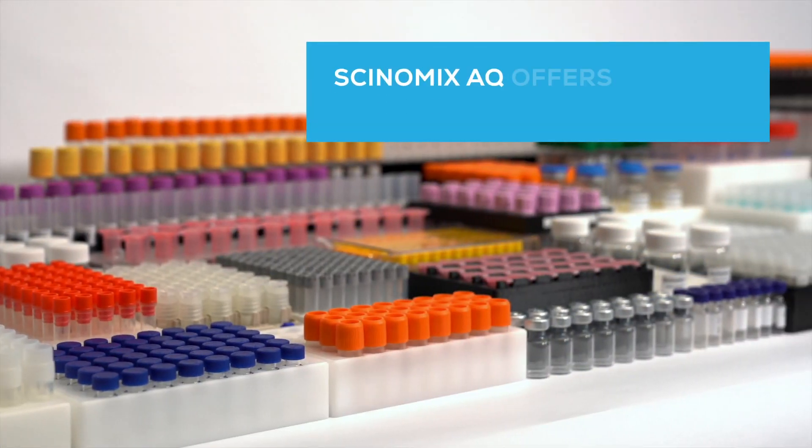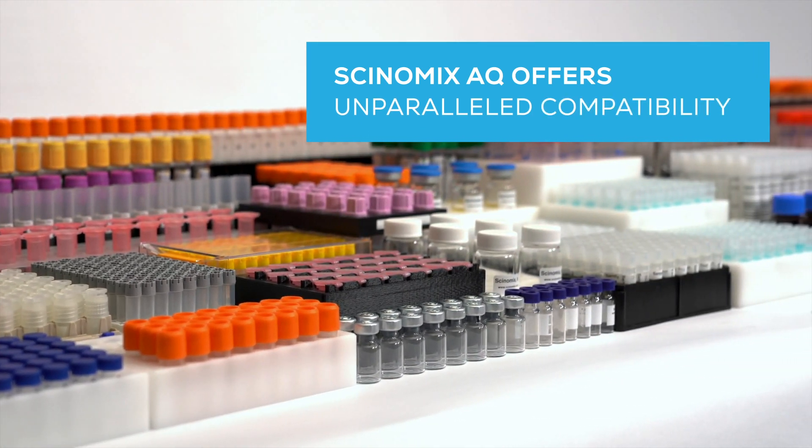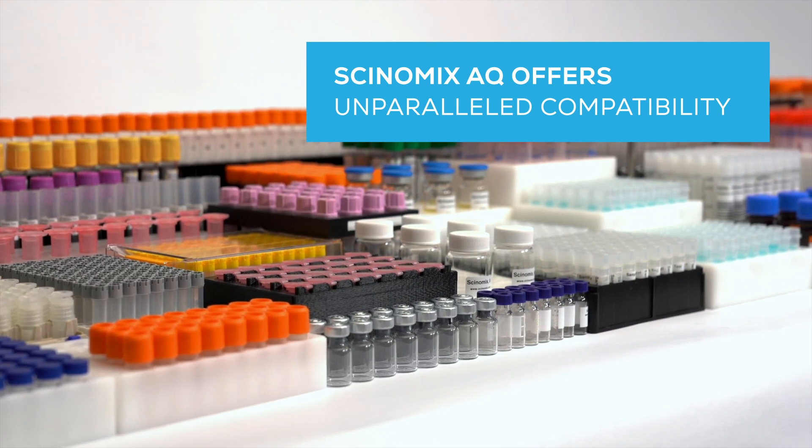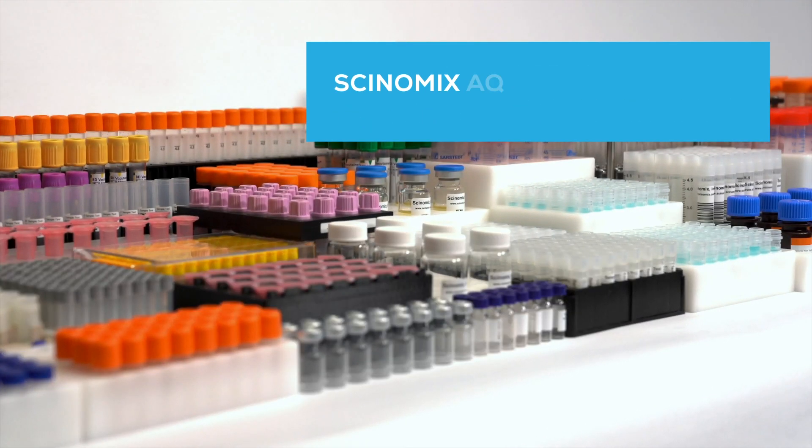The Synomics AQ offers unparalleled compatibility with a wide variety of tube types and sizes, from cryovials to vacutainers ranging from 0.5 to 50 milliliters or more, depending on the configuration.